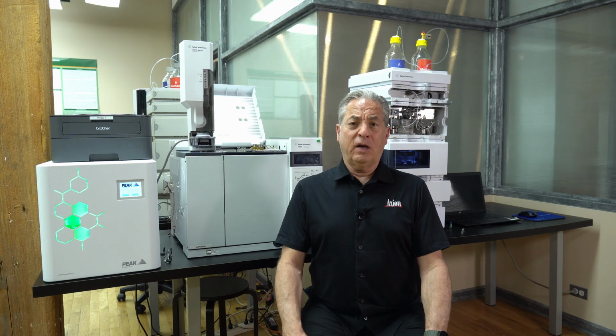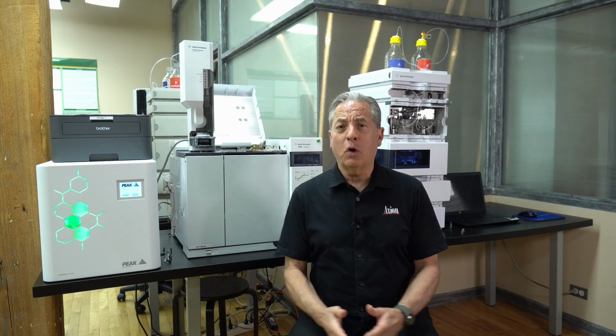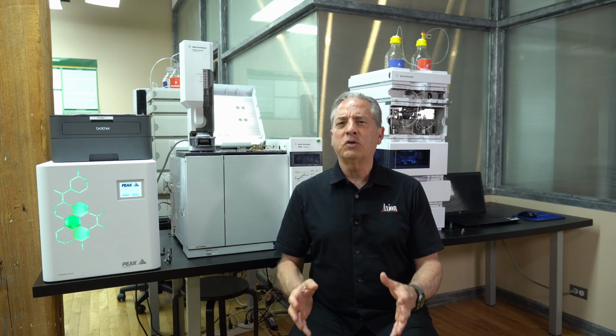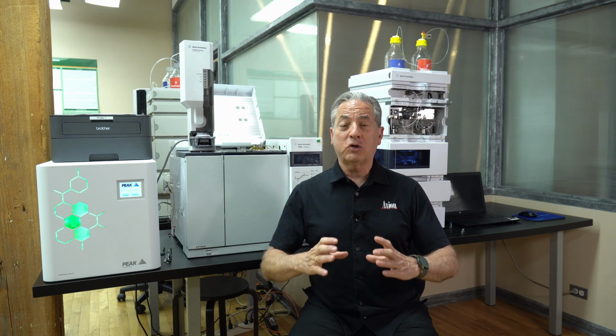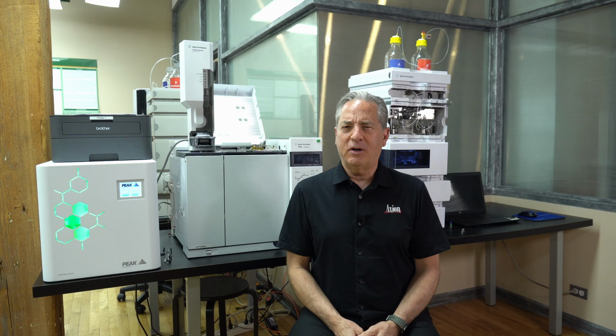And then you'll find where the temperature is too high or too low for the column, or where the flow rate is too high or too low. So essentially, you find every place where the method no longer works, and now you have proof that it works within this regime, within this set of parameters.